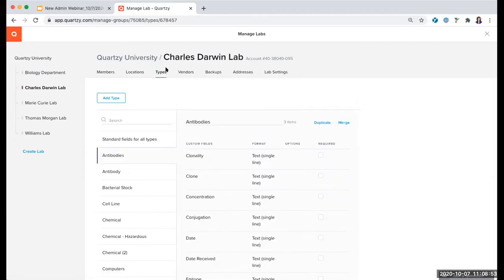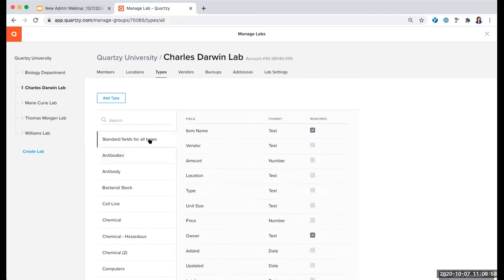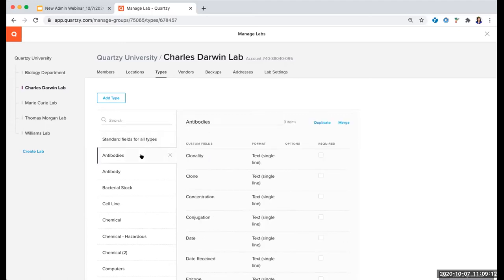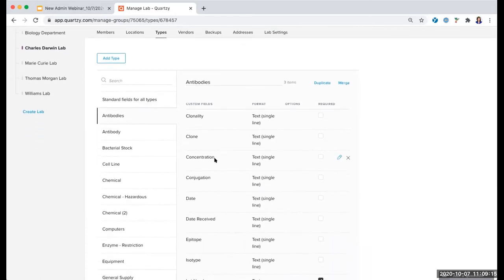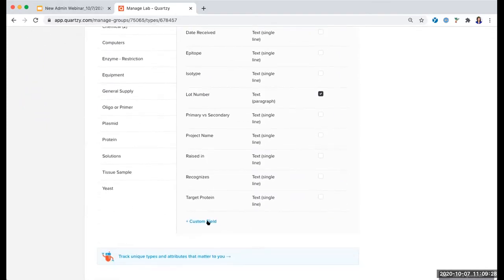Next we've got Types — this is how you will categorize your items. We have the standard fields all listed here under this first tab; these are the fields that cross all items in all types that you'll add to your inventory. But if I click the Antibody type, you can see that the custom fields are different — these can be edited for this type in particular. I can edit the individual fields already in here or delete them by clicking the X, and if I scroll all the way down to the bottom, I can add more custom fields.